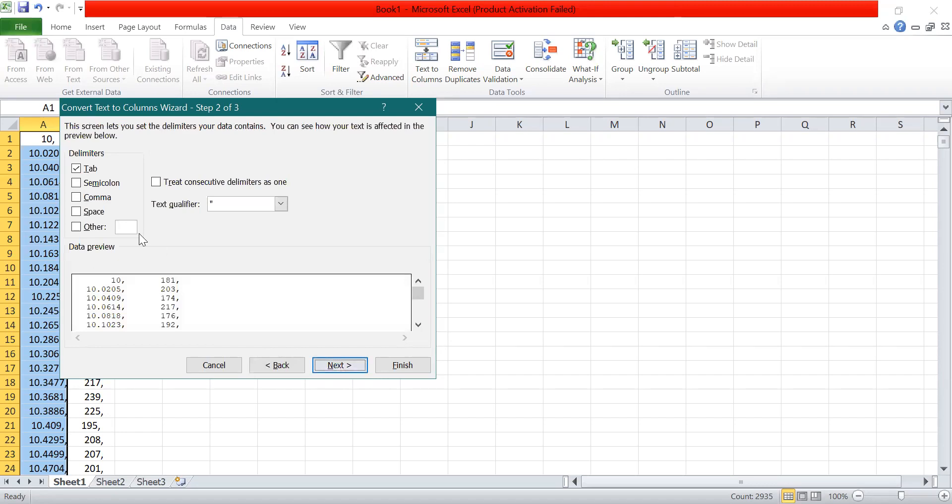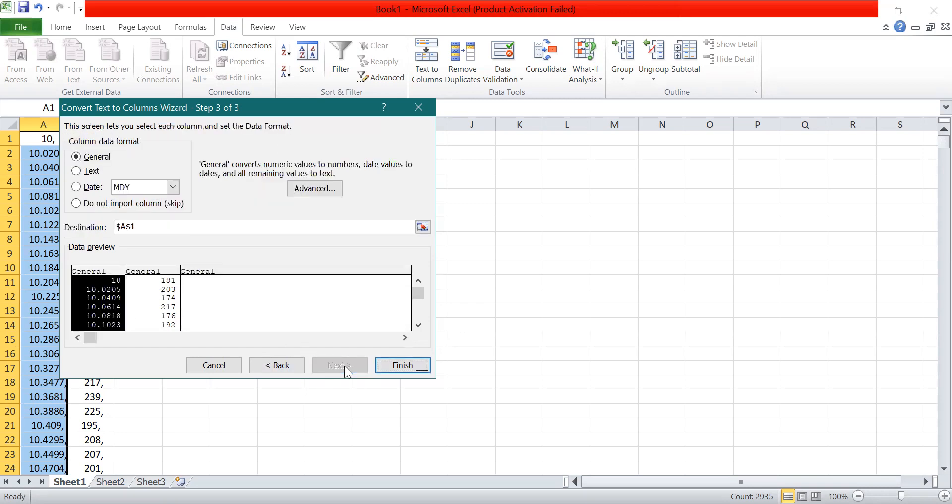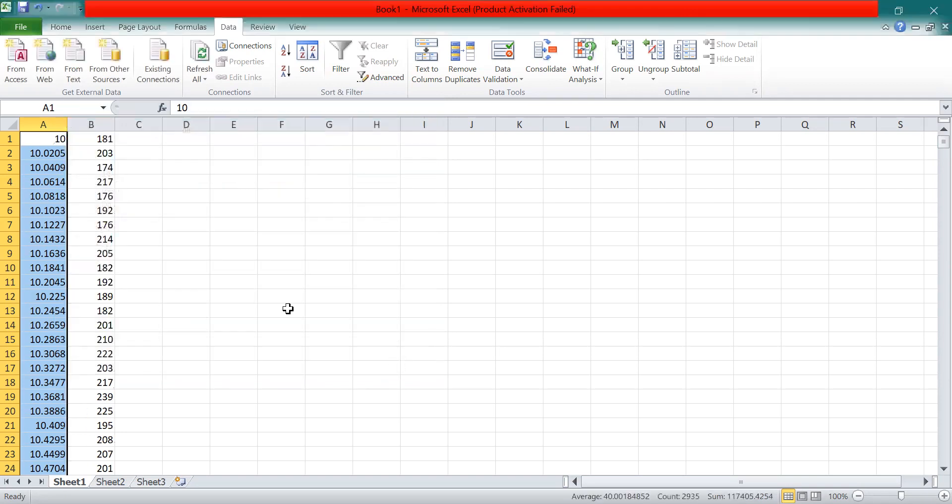Once you click Next, here we have options: Tab, Semicolon, Comma, etc. Because we have an issue created by the comma, just click on Comma. You can also check in the preview. Click Next, then click Finish. That's how we can remove the comma.